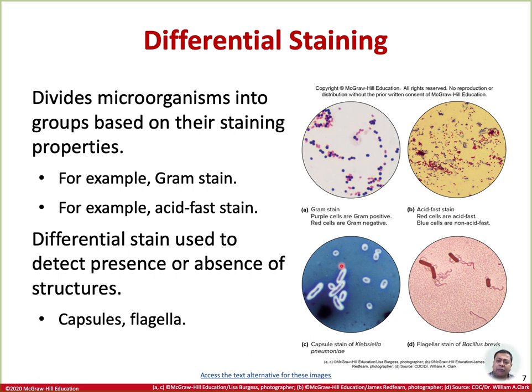So the background is stained by an acidic dye. I'm going slow here. The background is a glass slide which is stained by an acidic dye, which essentially has negative charges. The glass slide is inherently positively charged. So the acidic dye, which has negative charges, is attracted to the glass slide, and thus the dye binds to the glass slide. So the glass slide becomes this uniform blackish gray color. This is what is called a negative stain.